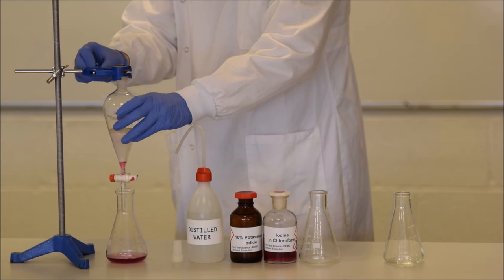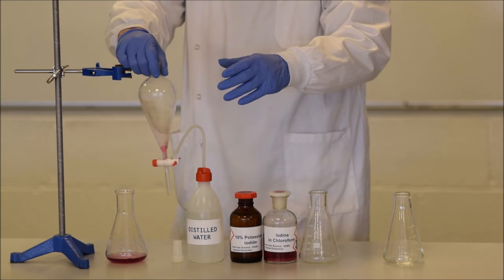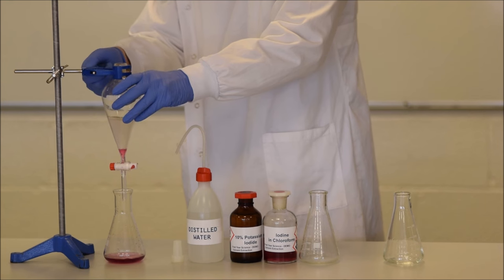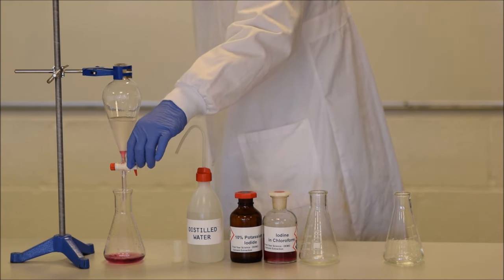And just before the end, you can take it out of the clamp and swirl it around in case there are any little blobs of solvent stuck up in the water layer, as can often happen. Clamp it again and finish draining it. Once you finish draining it then, we want to take the water layer out.